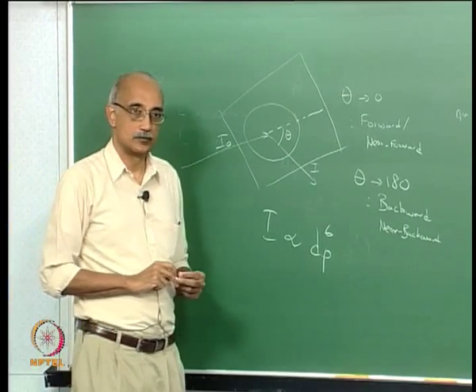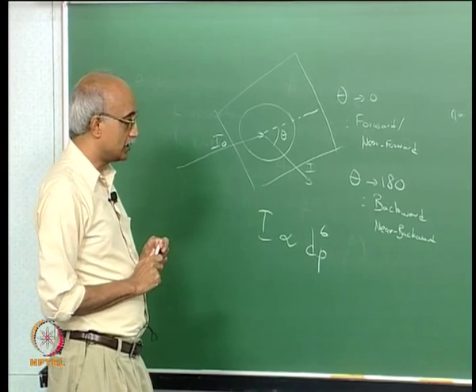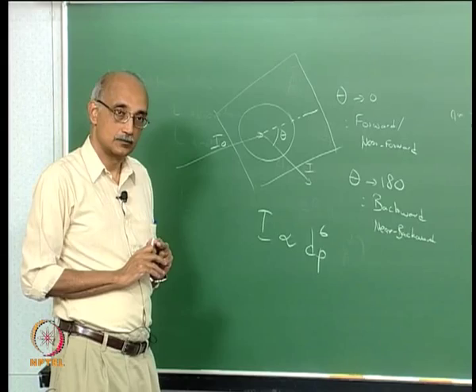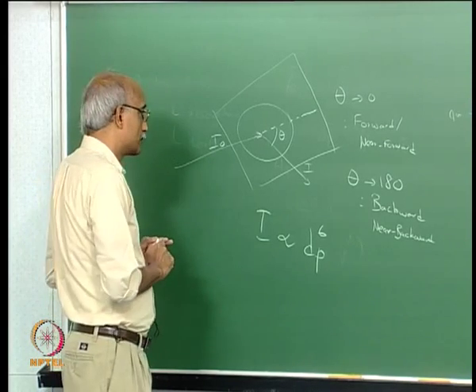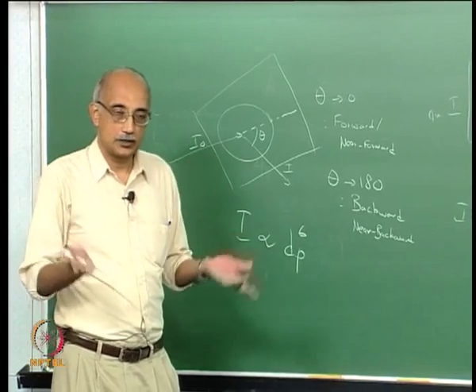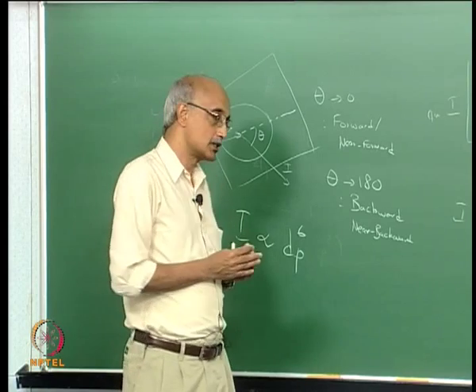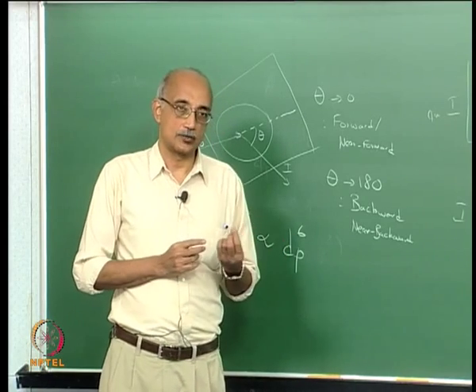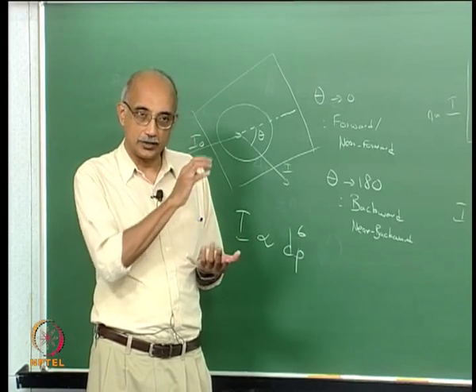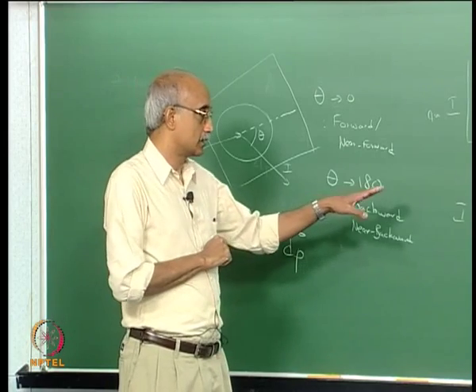-6. No, the scattering intensity. Where are we measuring it? The scattering intensity we talk about is the total integrated scattering that's occurring because of the presence of the particle. A good light scattering instrument will measure scattering as a function of angle, essentially look at scattering at various theta values and then summarize them. So this is the correct dependence.